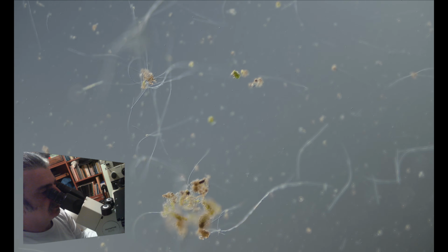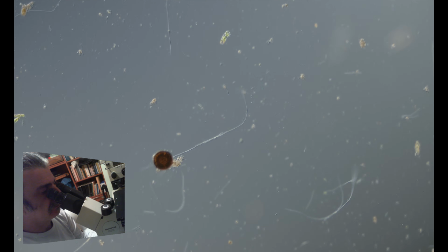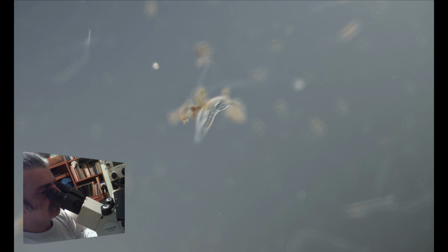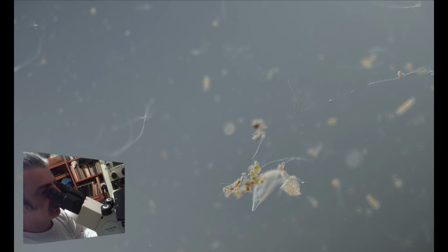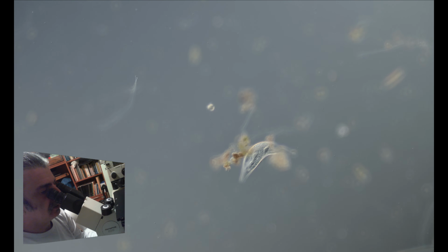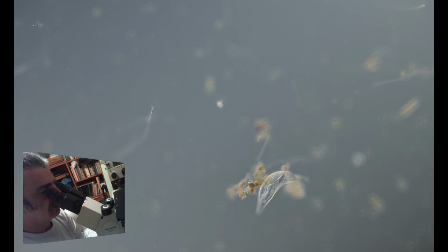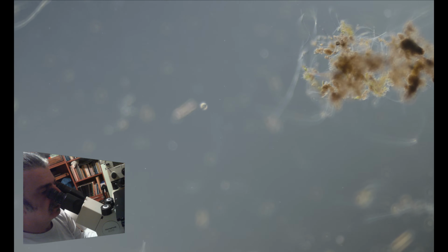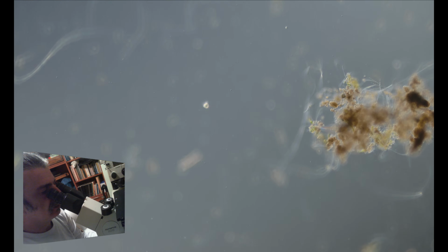And I can't find the Trachelomonas that I spotted earlier. Oh, here is another small ciliate, very common, called Halteria, and we can ID it from the way it moves and jumps around.